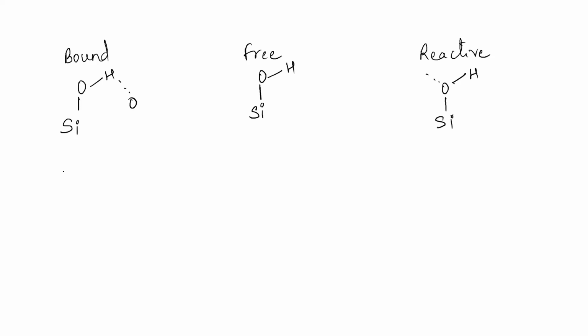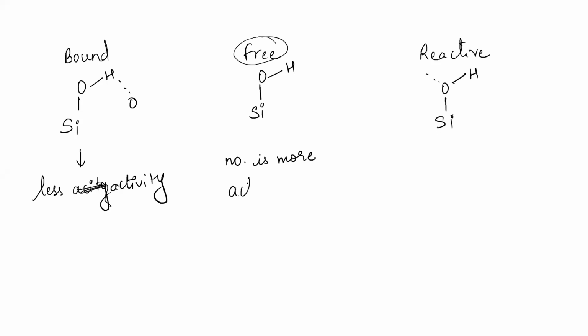If it is bound, the activity is less. If the number of free silanol groups is more, the activity is more. So the silica gel is actually very, very active. If the number of reactive silanol groups is also more, then the activity of silica is more.